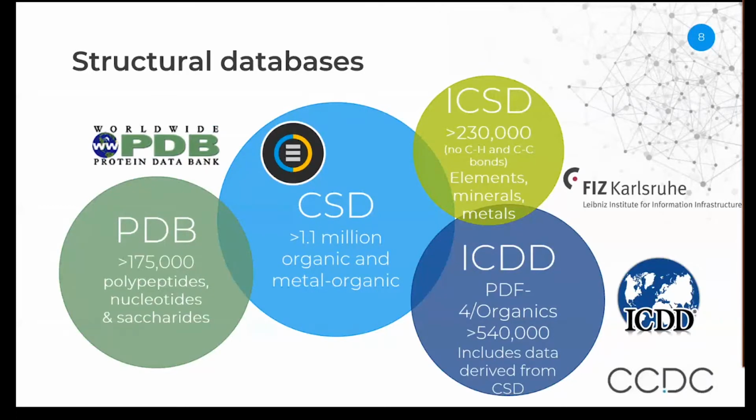While you're filling that in, let's have a look at some crystallographic databases and remind ourselves what databases are available. At the CCDC, we curate the Cambridge Structural Database, which covers organic and metal organic structures. But alongside the CSD, the Worldwide Protein Data Bank manages the PDB of macromolecular structures, and you can do pharmacophore searches across both the CSD and the PDB using CrossMiner.